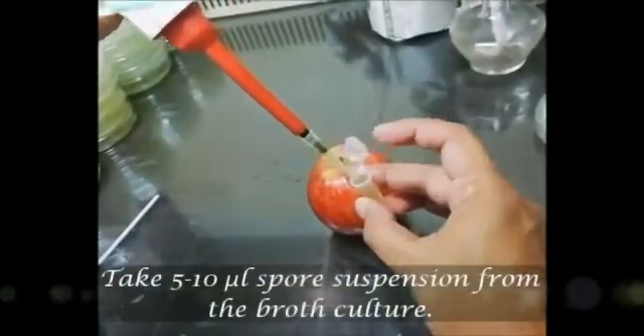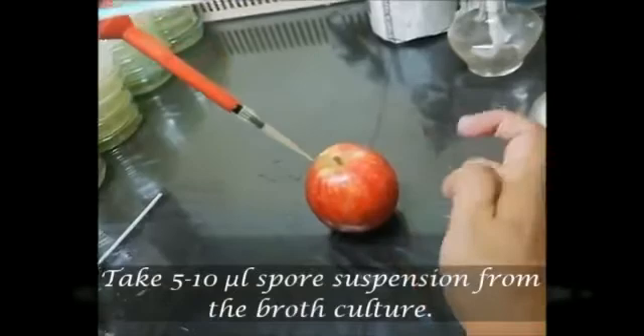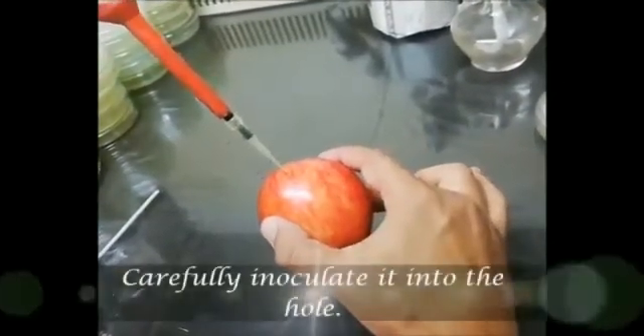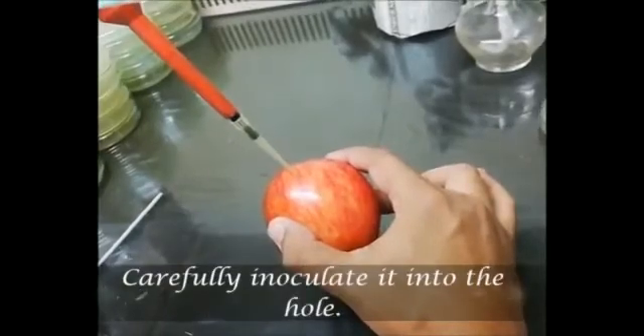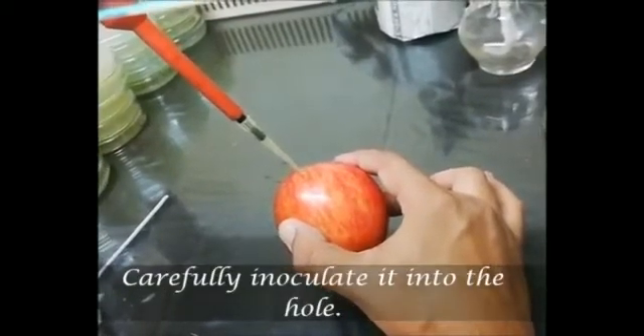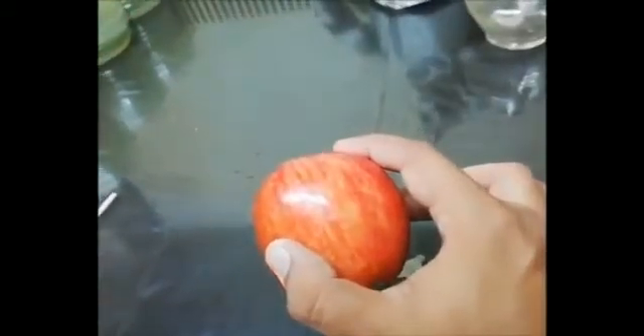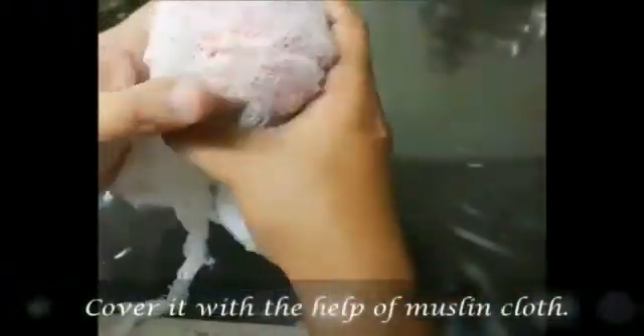Take 5 to 10 µl of spore suspension from the broth culture and carefully inoculate it into the hole. Cover the fruit with the help of muslin cloth.